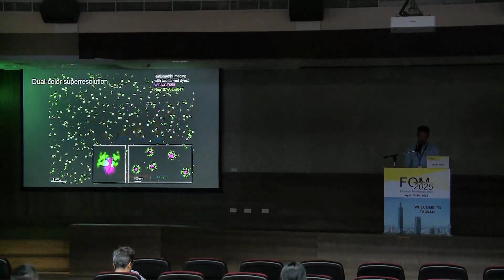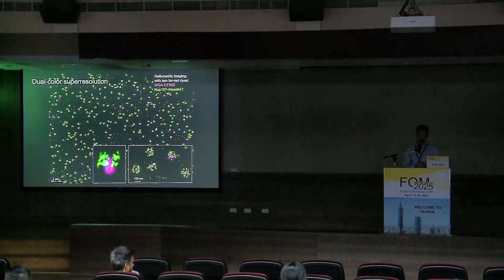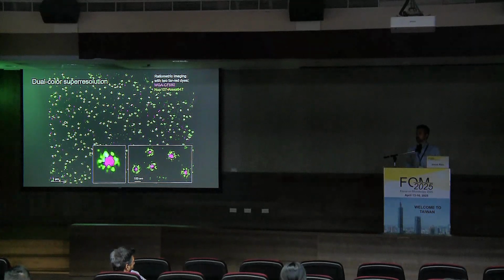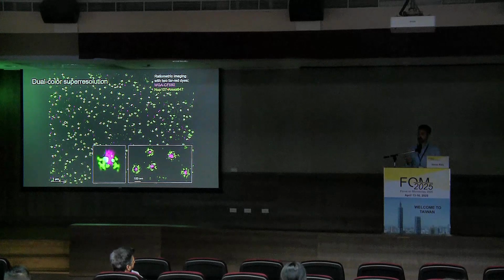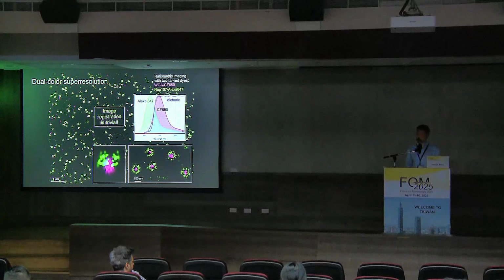But something that I think is very useful and that we like to do a lot in my lab is called ratiometric or demixing single molecule localization microscopy. The idea here is to label your target structure with 2 dyes that are spectrally very similar and that have similar blinking characteristics in the same blinking buffer. Then you image these 2 fluorophores with 2 spectral channels, and you split the spectral channel somewhere between the fluorophores.